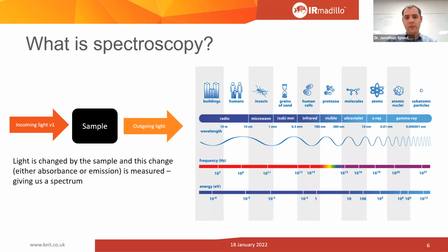There are chemical versions of this. They're called NMR machines, nuclear magnetic resonance, but they're not really designed for online use and for processes. They're fantastic for laboratory studies, but they're not great for day-to-day. There are some new instruments coming onto the market that are effectively auto samplers coupled up to them, and for very niche applications, they're really powerful. But for the day-to-day, I wouldn't advise using one.